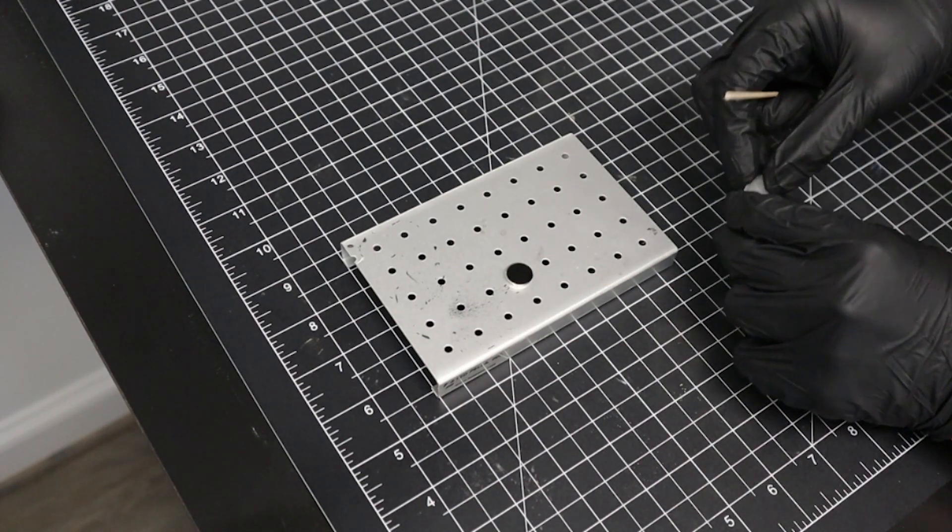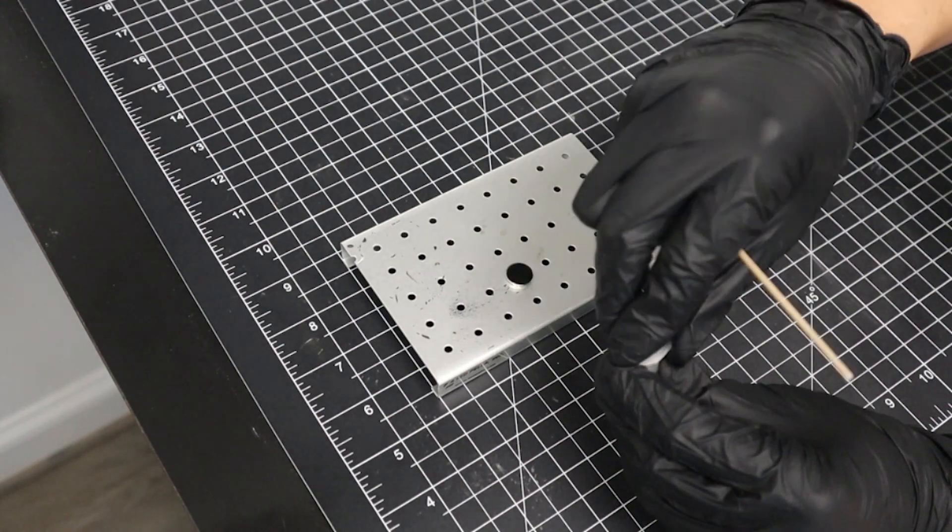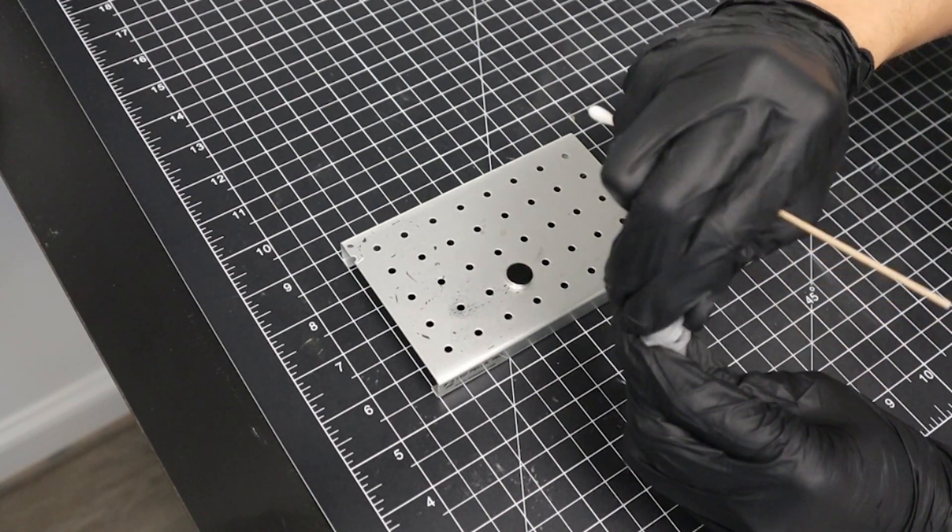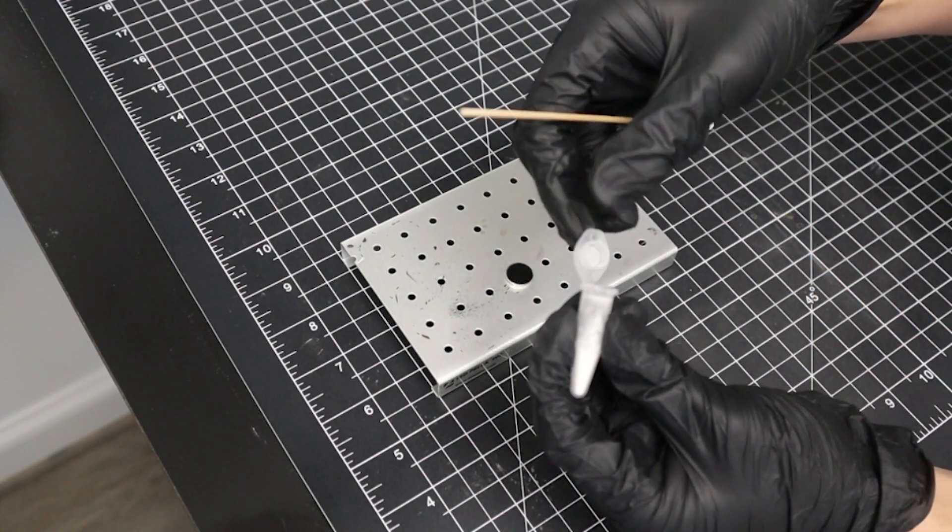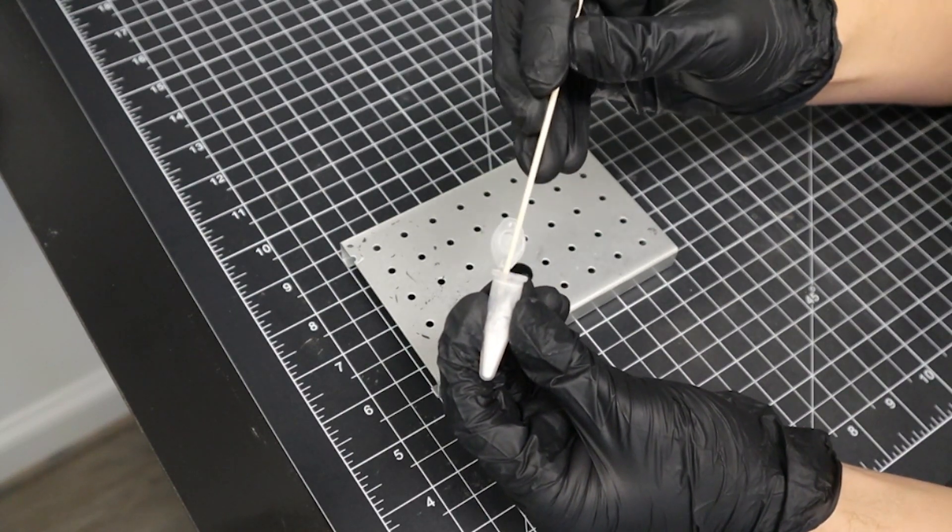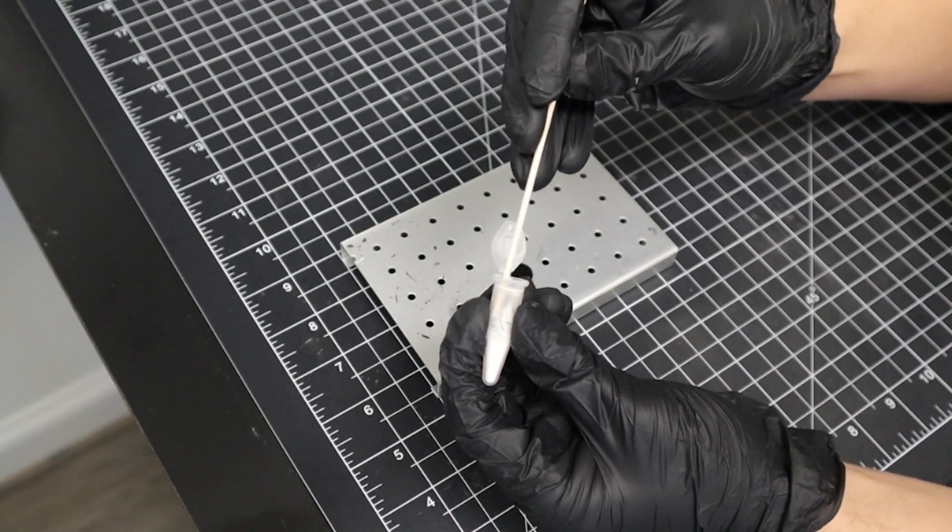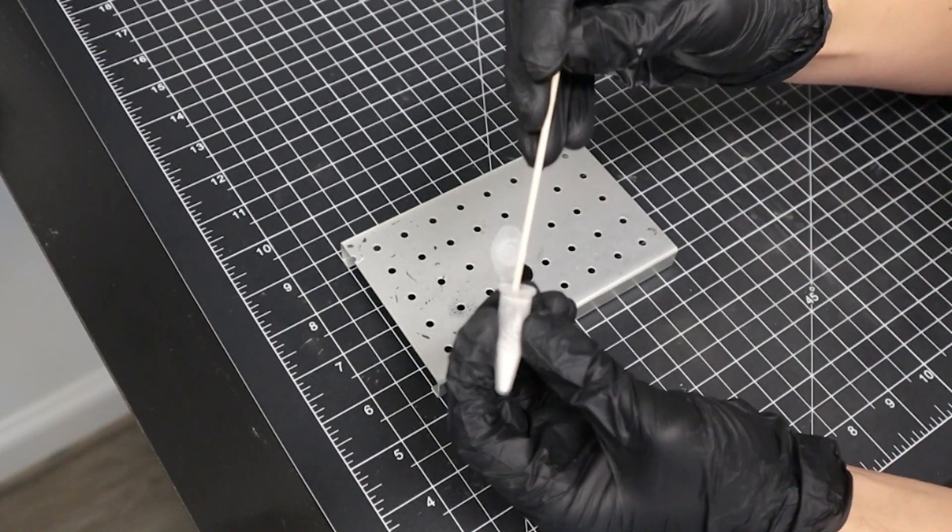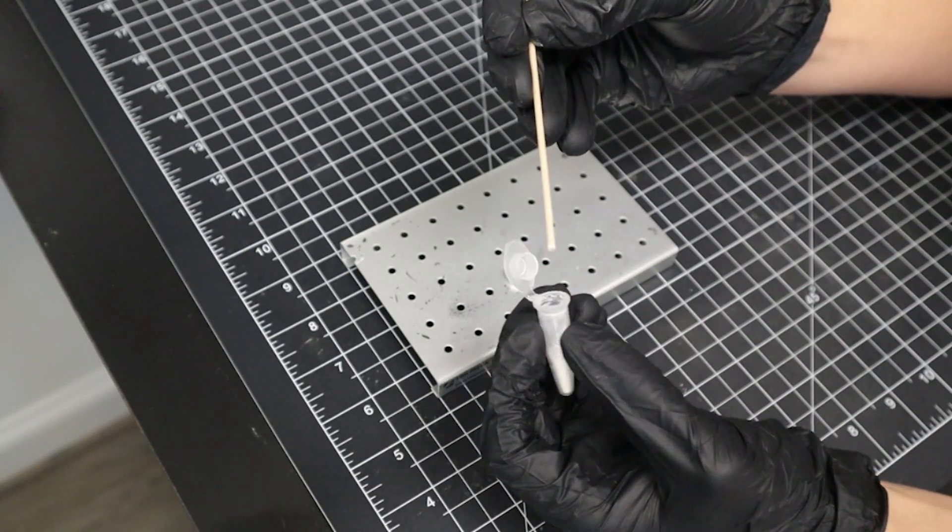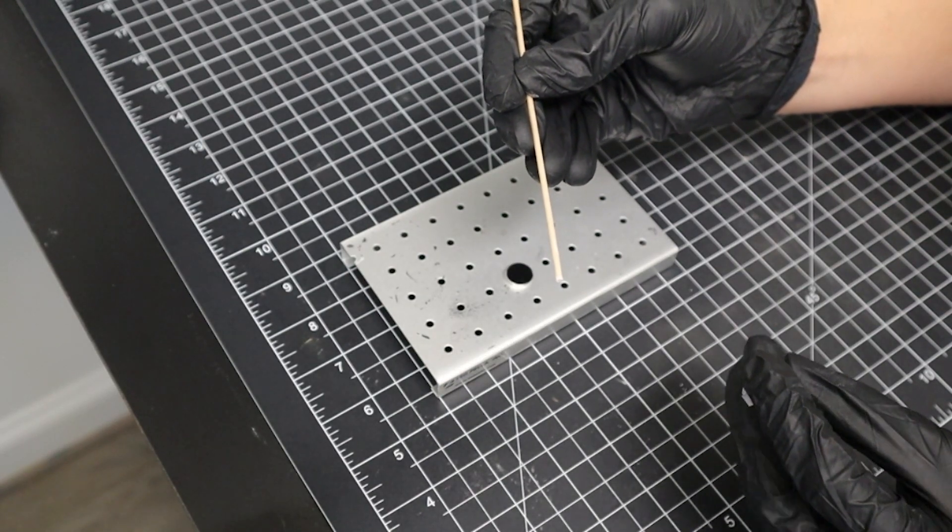We start by inserting the wooden end of our cotton swab into our powder sample. The particles will attach themselves to the wood, allowing us to easily transport a small volume of powder to our sample stub.